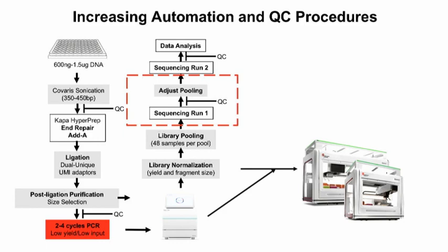So what that's led to is, as we looked at this from a holistic perspective, we can do more sequencing and get more depth of coverage to correct for some of these problems. We can overlap reads to correct for some of the problems, and then we can also add more automation steps, which we've transitioned most of to Beckman i-Series robots, both i5s and i7s.